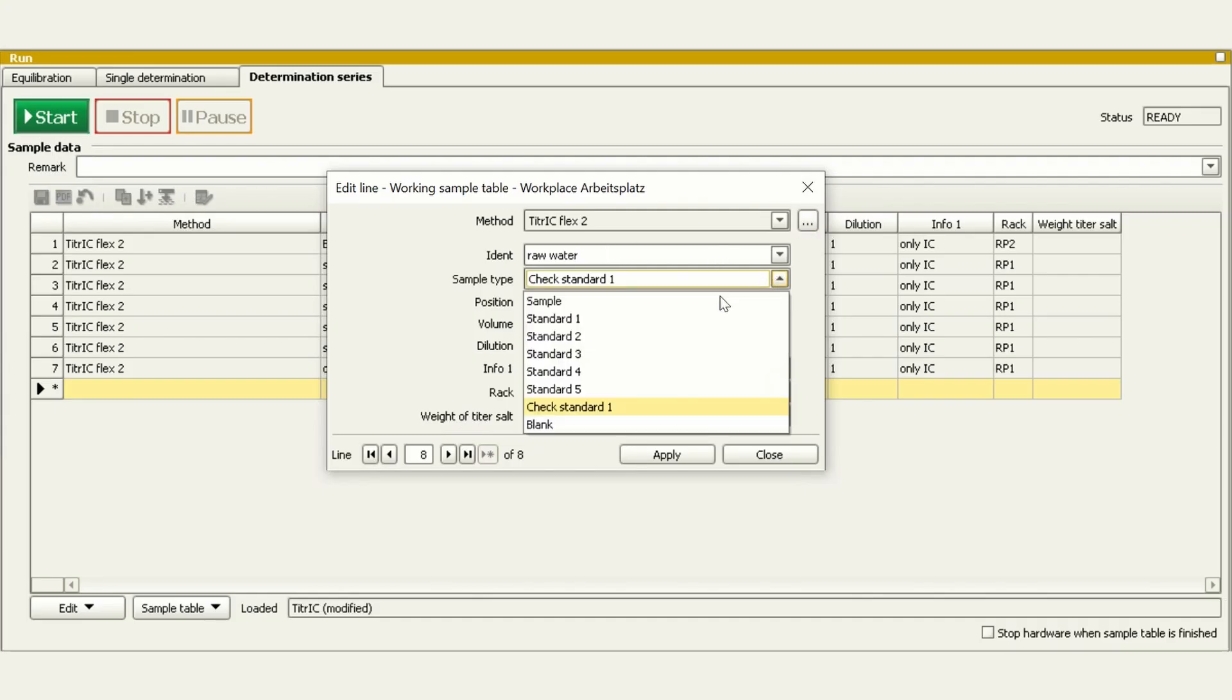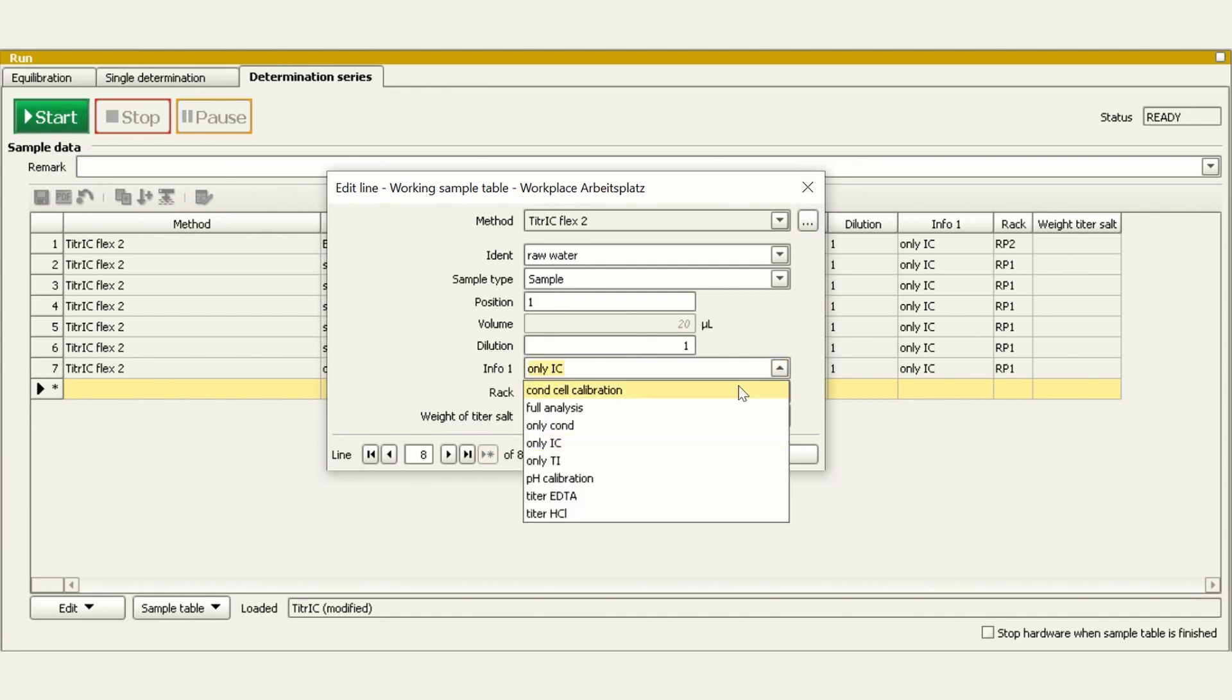For each sample you can decide whether to perform only titration, conductivity measurement or ion chromatography, or to run all of these methods combined. The system then automatically handles the determinations. It's as simple as that.